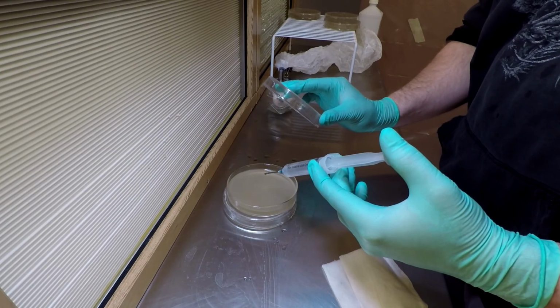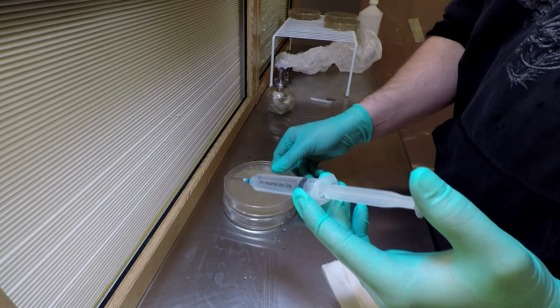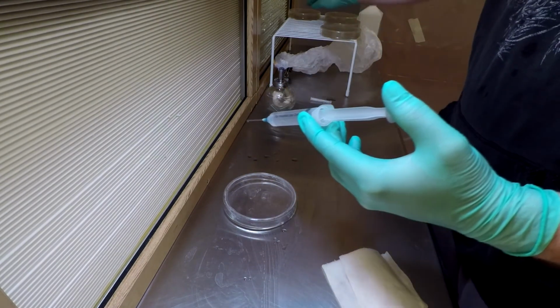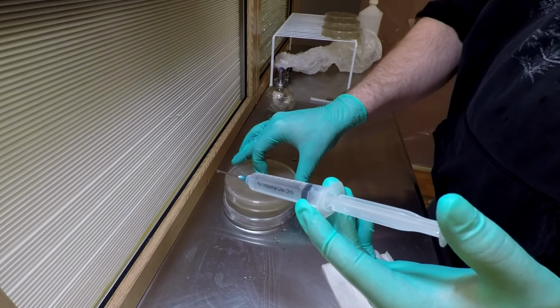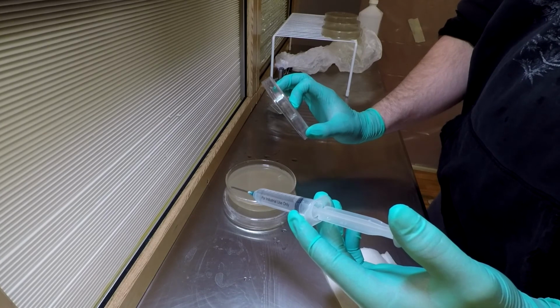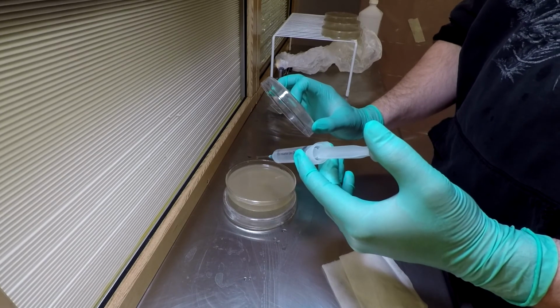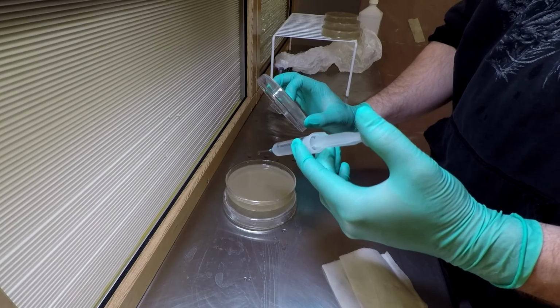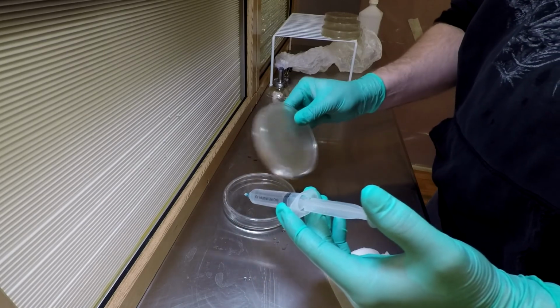Notice how I use my right hand. I got a little more there too. I use my right hand to take this top of the dish and I angle it. When I pick it up, I always pick it up and angle it so there's nothing between my fingers. There's nothing between the dishes. My fingers aren't in there. I leave it to the side so air can get between where the needle is too. There, that's a bit better. There's 2 drops on that one.